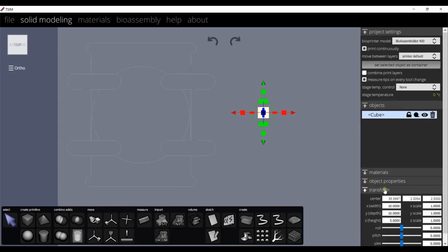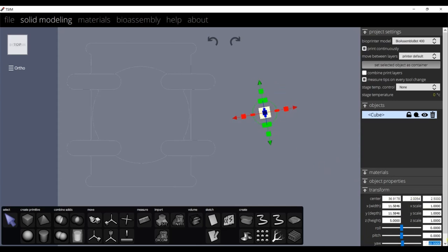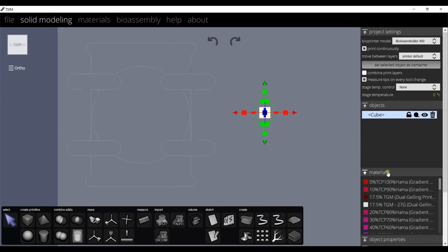Under Transform tab, we have options to manipulate the object, to scale, to move, or rotate. Use these handles on the model to manipulate the object or we can change the values here as needed. After modifying the object as needed, we can assign a material for this object.